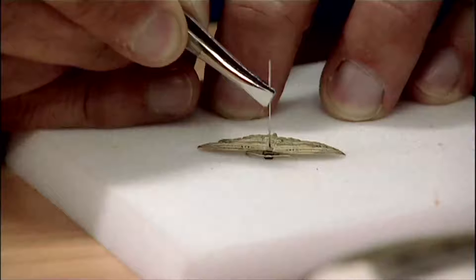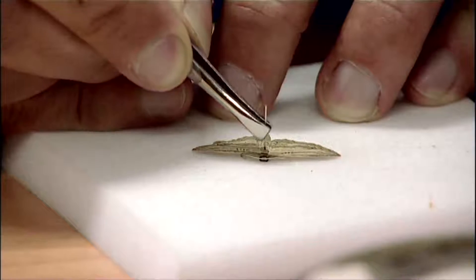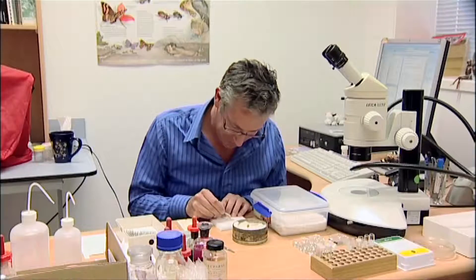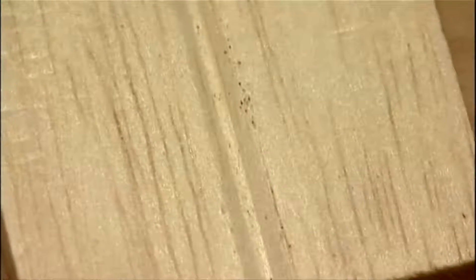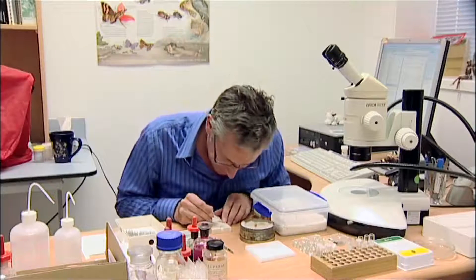These are special entomological pins that you have to get from an entomological dealer, and I'm going to pin it until it's about halfway up the pin. Now I'm going to pin it into my setting board, which is made out of balsa wood. I've smoothed the surface of the balsa wood with some very fine sandpaper so that it doesn't stick on the wings and remove the scales.